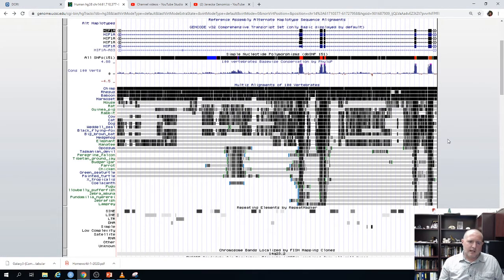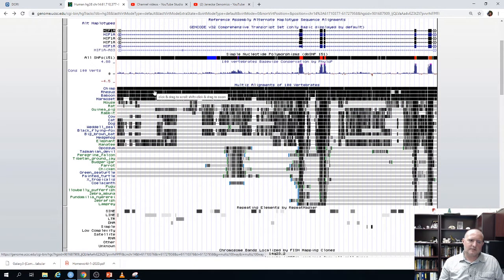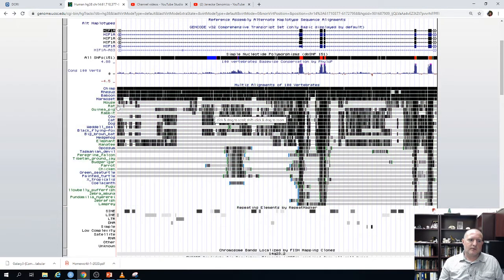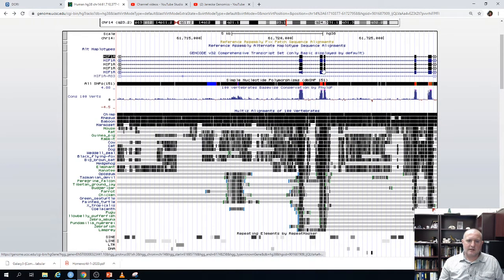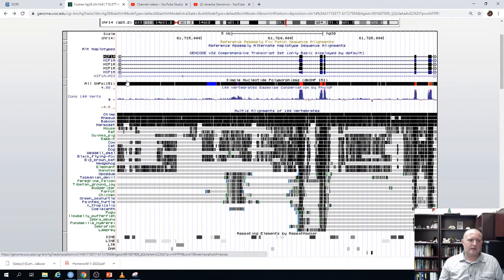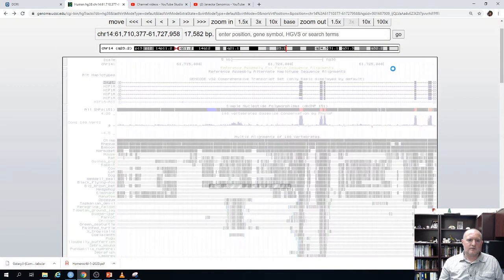Notice that each row works as follows: if the sequence is present and similar to the reference, it has a dark bar; if the sequence is absent, has a gap, or is very divergent, it's gray instead of dark. Looking at mouse and rat, they have conserved sequences for HIF1-alpha exons compared to the human genome, but the introns are not similar at all — quite divergent in rat.